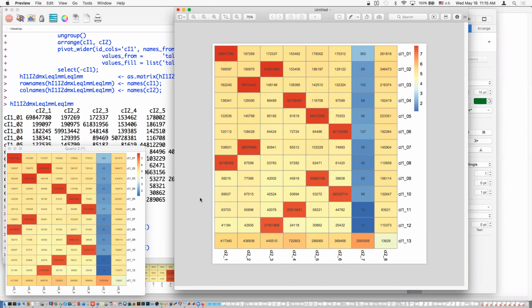Now, even a unique dual does not make index hopping go away, right? Because it's still possible for somebody here to hop to here, say, but it's hard. Because what's index hopping? It involves some kind of event where the I1 is wrong, or the I2 is wrong, or they both got wrong. Maybe the ones where only one changes are easier to do and the ones that take two changes are harder.